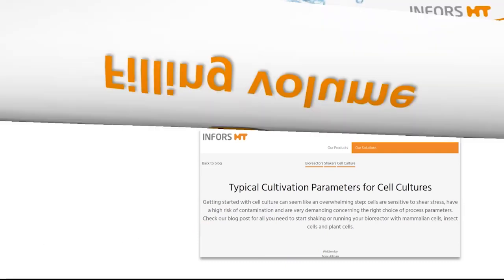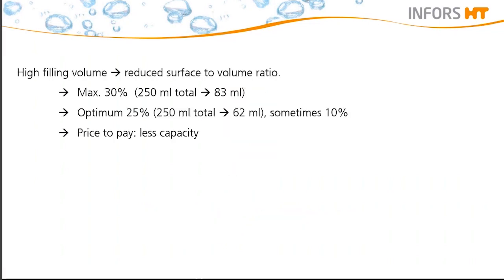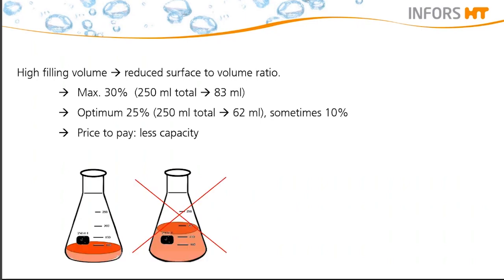Another very important factor with a big influence on oxygen transfer and therefore cell growth is the filling volume of the flask. A typical shake flask is usually filled between 25 to 30% of its working volume. This is enough for processes that just aim to generate biomass or for microaerophilic or slow-growing organisms. The higher the filling volume, the smaller the surface gets. This will lead to insufficient oxygen transfer. Moreover, a high filling volume will also reduce the liquid movement within the flask due to the angled sides of the flasks.